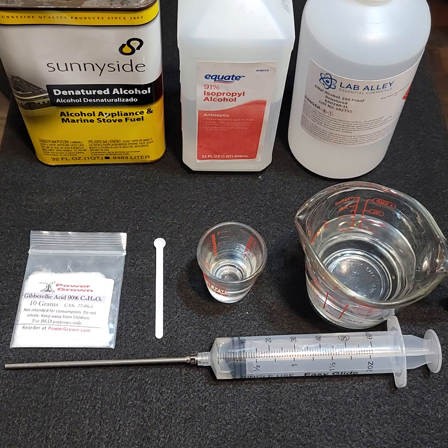Hello everybody, this is Aaron with Power Grown. Today I'm going to be showing you how to dissolve gibberellic acid. For that you're going to need an organic solvent such as alcohol. Two different kinds of alcohol will work — I recommend ethanol, which is basically the type that you drink. If you can get 70% pure ethanol or higher, that'll work for this purpose.